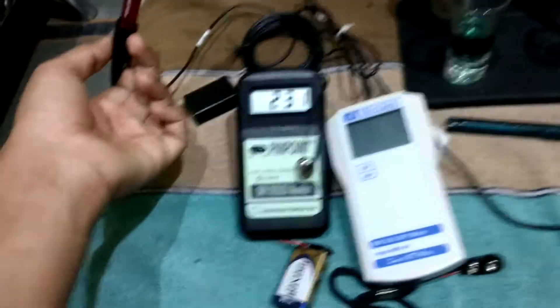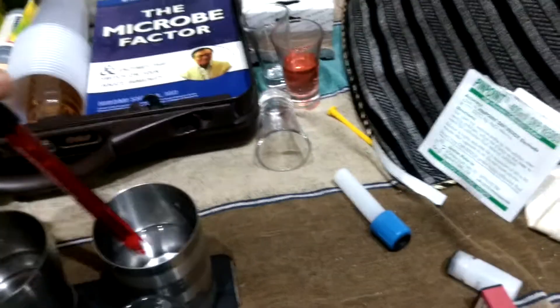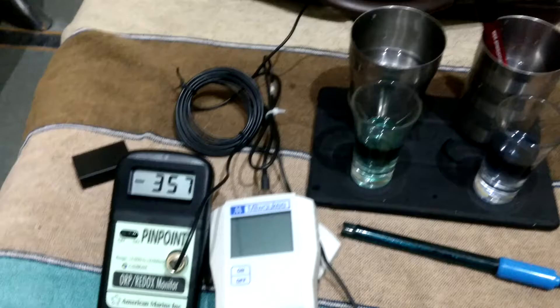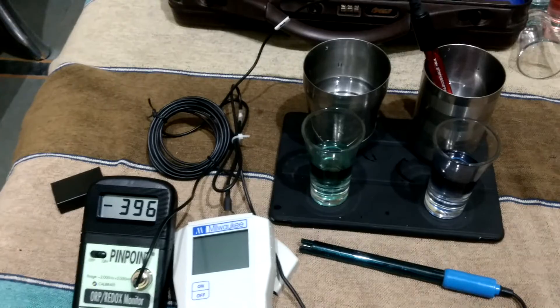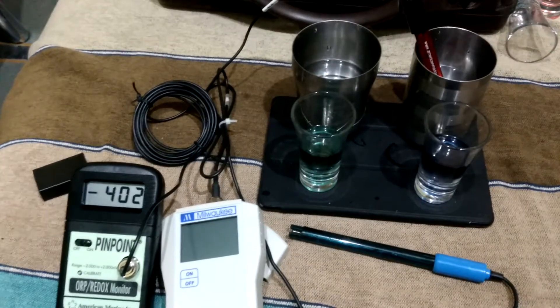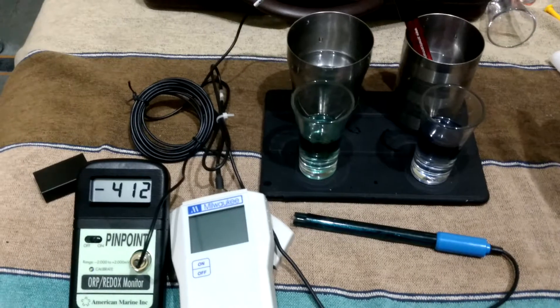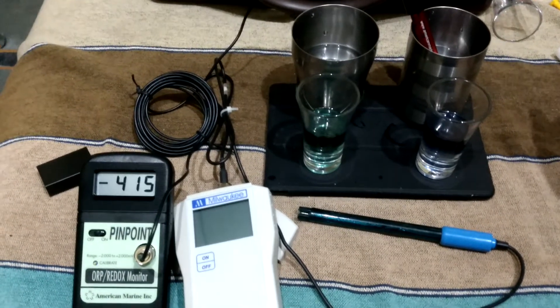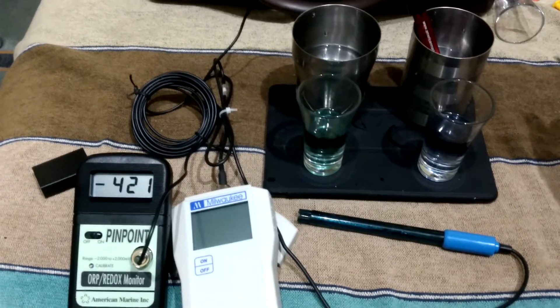Now I have my Pinpoint ORP meter - this is the American Marine Company. I will check it out in our Kangen water. Immediately 389, 390 and 400. In a second it went up to 400, then up to 470, and still increasing.